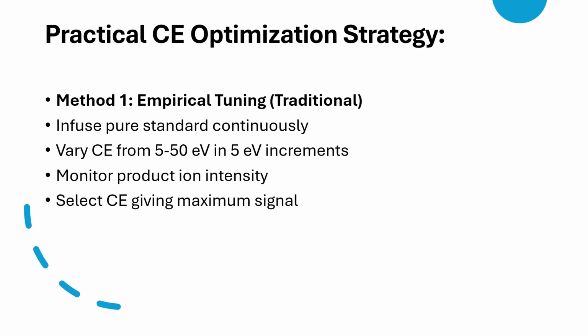Now, why collision energy optimization is complex is that recent research shows that collision energy response curves are not simple bell curves. They can show a single maximum, which is simple and easy to optimize; a broad plateau, that is a wide working range; and third, double peaks, that is, it can consist of two optimal energies.